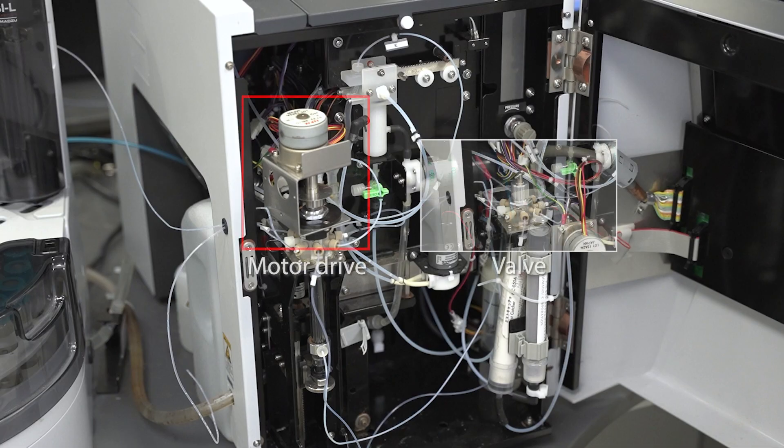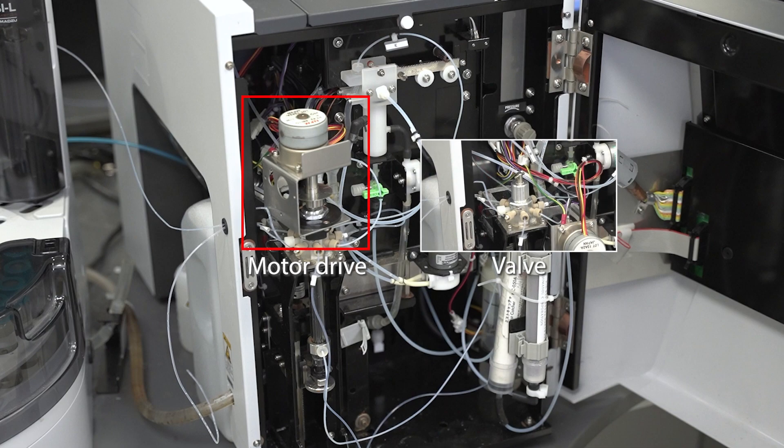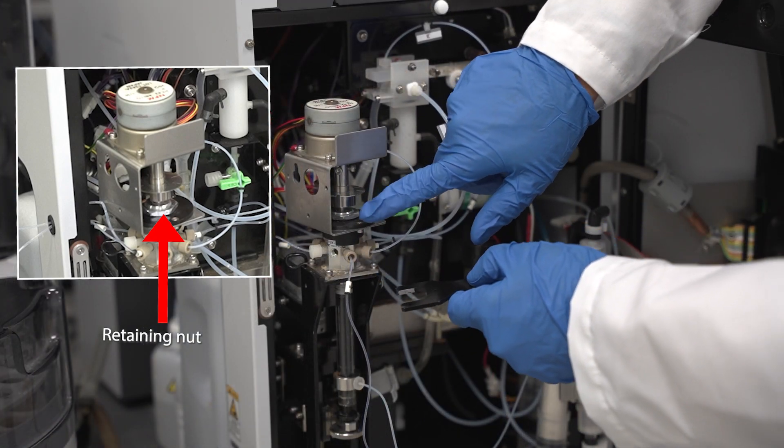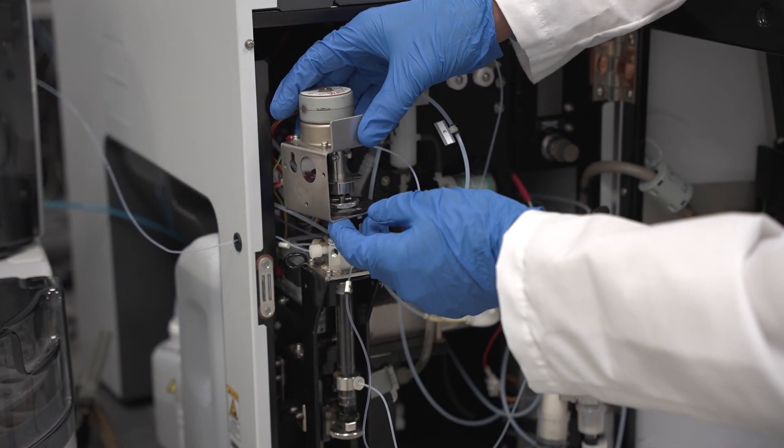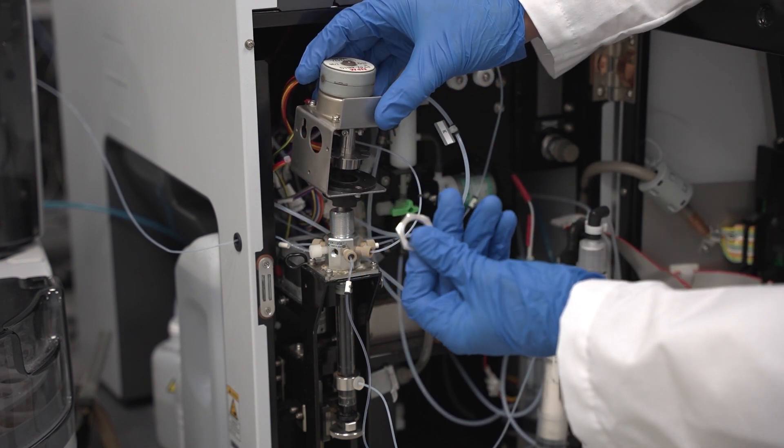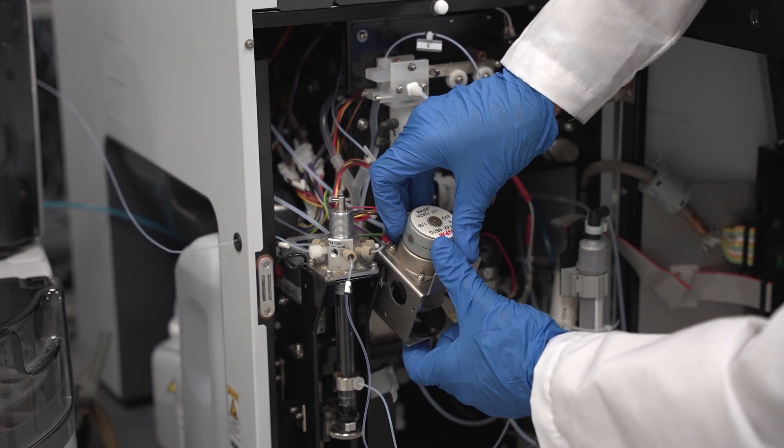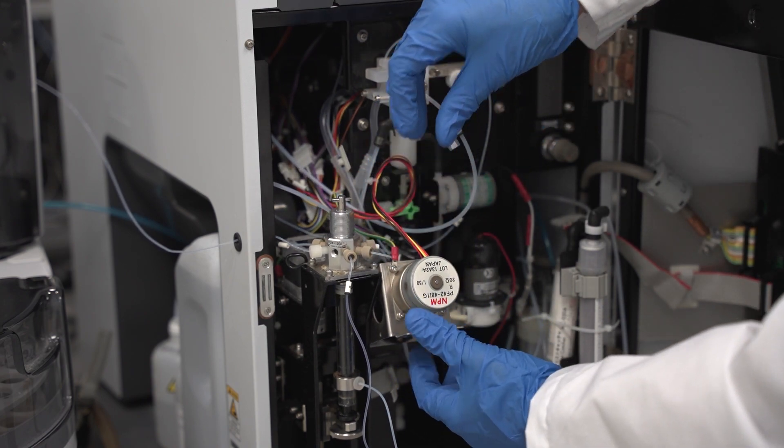To remove the rotor, you will need to take the valve apart by disconnecting the motor drive from the valve. Use the larger side of the black wrench to loosen the large retaining nut. Lift the motor drive assembly up and off the valve. Use the slot on the side to hang the assembly on the screw located on the side of the syringe drive assembly.